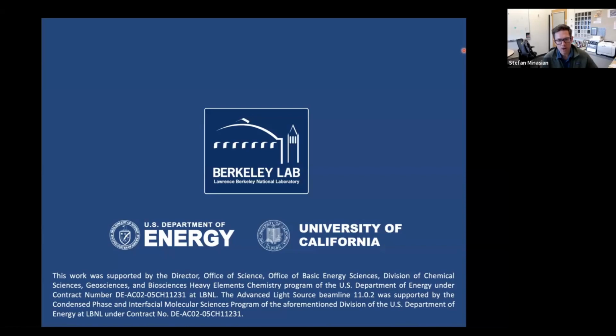So we had tried doing some electron yield measurements many years ago. The main reason we don't do electron yield, well, there are a few reasons. If you do those measurements right, you can get pretty high quality data. But for our systems, we found that transmission gives much more reliable intensities. And you don't have the sort of surface contamination issues that you might have with electron yield measurements.